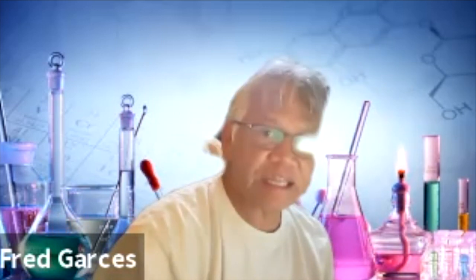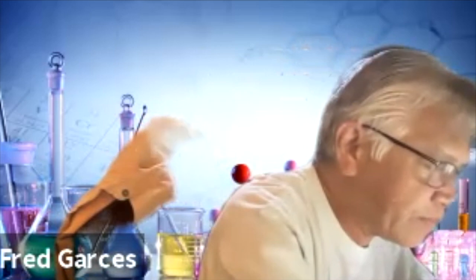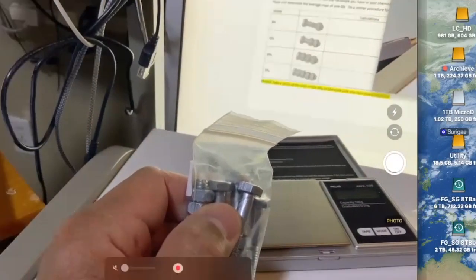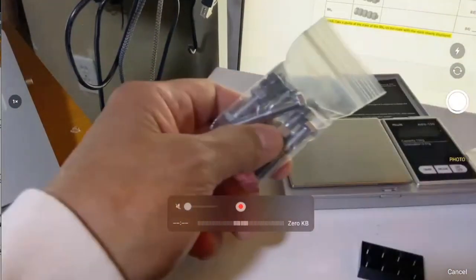Okay, this is the lab manual. You are going to be weighing these, so you have a baseline mass, just like we have the mass of the chlorine atoms, the carbon atoms, and the aluminum atoms. These are going to be your building blocks for our little experiment. You've got the hex nuts, you've got the bolts. In terms of the hex nuts, you should have a packet that looks like this, and this packet will contain bolts and hex nuts.